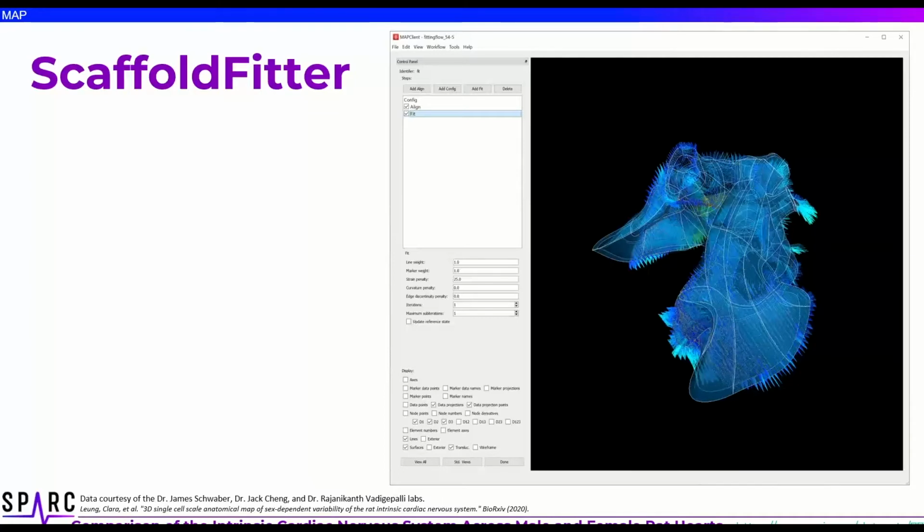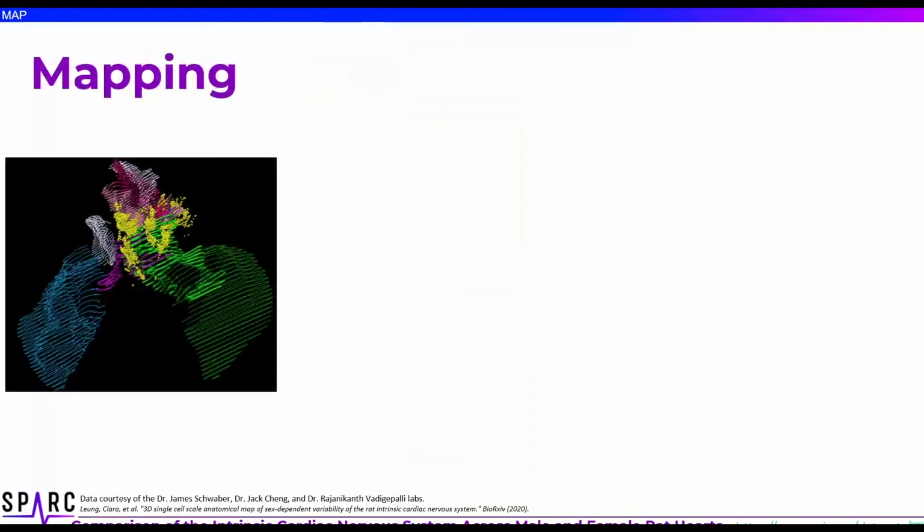The result is a scaffold that has been fitted to represent the exact same anatomical points as the data, labeling the same piece of tissue across all configurations for an individual or an equivalent anatomical location across multiple individuals. I should probably mention that the scaffold fitter software allows for parameter tuning in situations where data is distorted and fitting is difficult. As you can see here, there are a number of parameters which regularize the fitting by controlling, for example, the amount of deformation and/or curvature or other things, just to ensure a smooth shape is produced at the end.